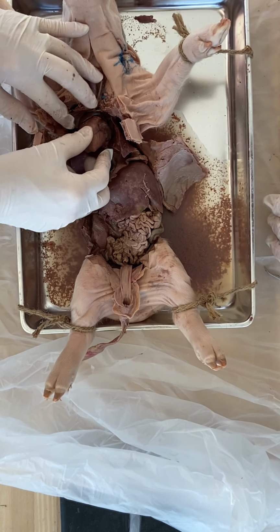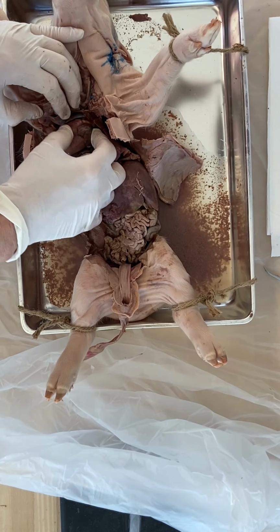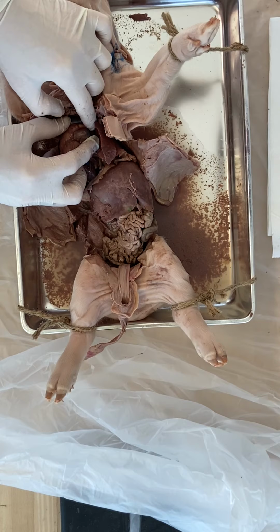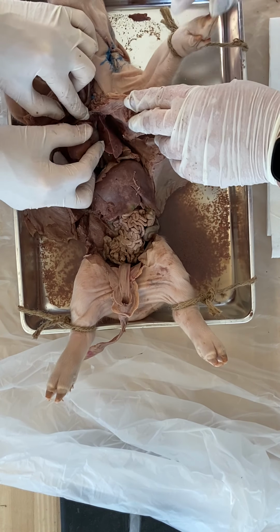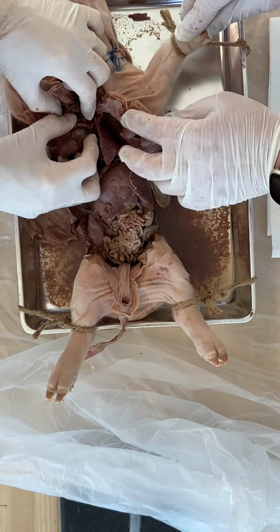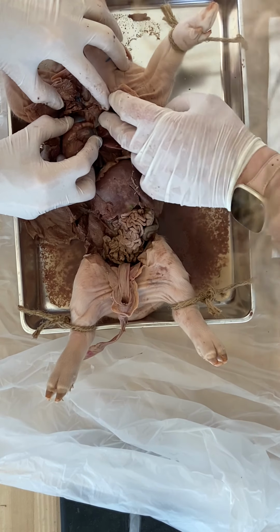How many days this week are we doing this? Oh my goodness. All right, so we are on heart removal. I can tell that this is the pulmonary artery because it's coming out of the right ventricle. Yep. And somewhere is the aorta coming out of the other side. So if you just try cutting high, you should be able to get... Here, like high here. Let me move this membrane first. Hang on.